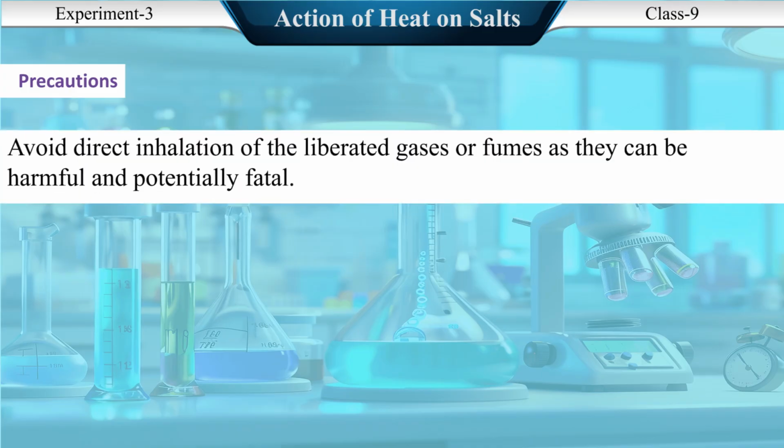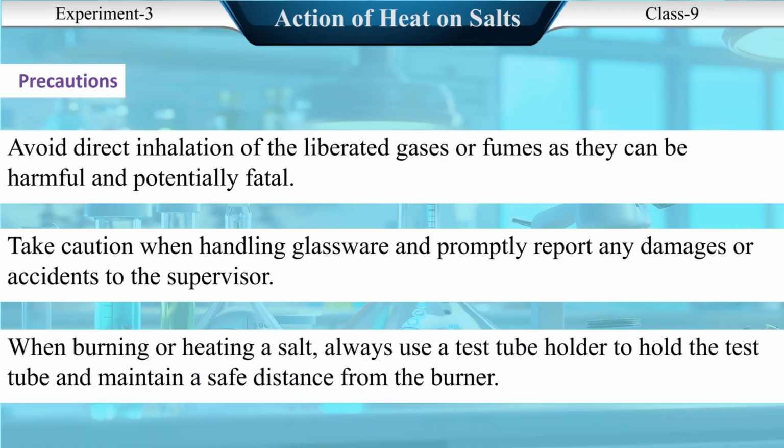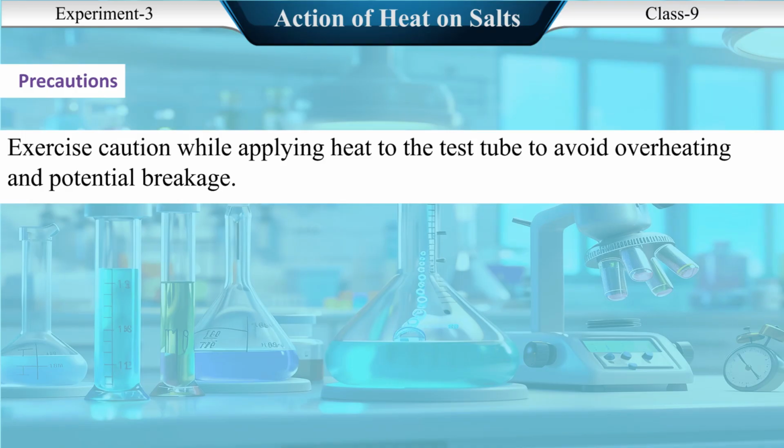Precautions. Avoid direct inhalation of the liberated gases or fumes, as they can be harmful and potentially fatal. Take caution when handling glassware and promptly report any damages or accidents to the supervisor. When burning or heating a salt, always use a test tube holder to hold the test tube and maintain a safe distance from the burner. Exercise caution while applying heat to the test tube to avoid overheating and potential breakage.